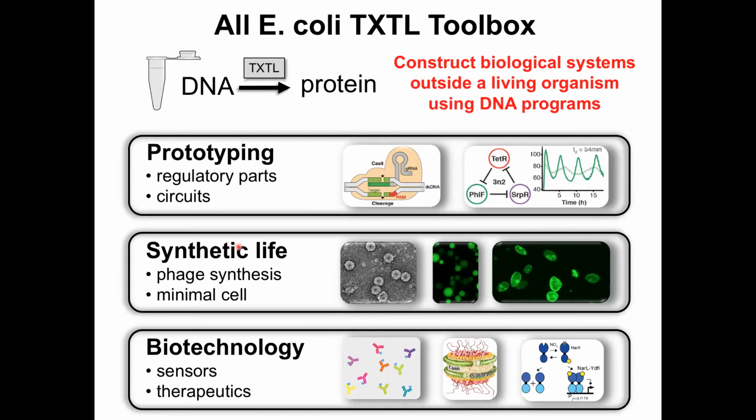We use cell-free expression in test tubes or on well plates, if you like, and we put the cell-free reaction also in liposomes to make synthetic cells. And the idea is to construct a biological system outside the living organism using DNA programs. I don't want to purify proteins. I want to do like a real cell and express genes.